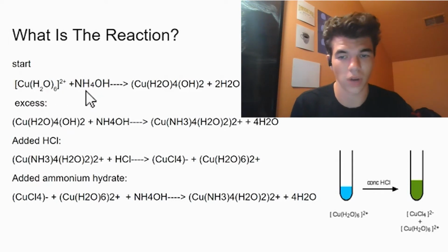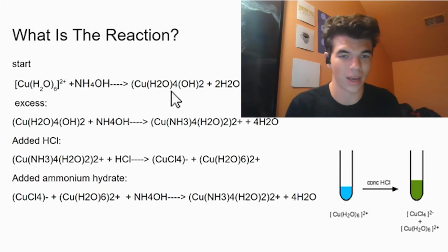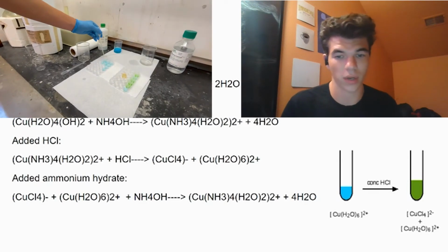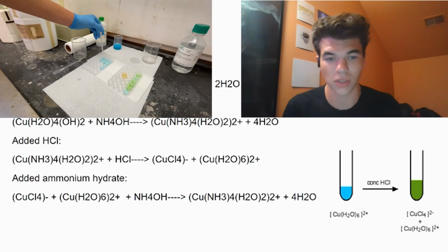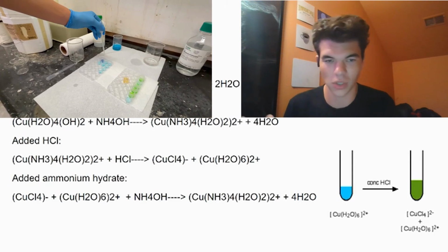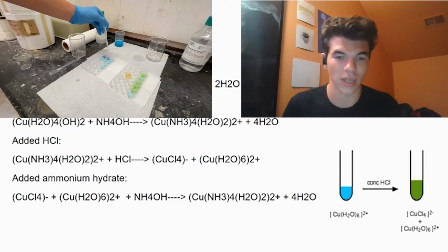Adding in the ammonium hydroxide shifts the reaction to the right, with the OH- of the solution from ammonia that's disassociated into the water as well, in that complex, as shown here. Becoming part of the complex with water, it makes it neutral, and this makes the solution into a slightly darker color that wasn't really shown because I used such a high molarity of ammonium hydroxide in the lab.